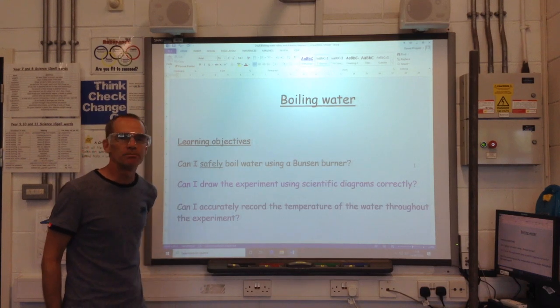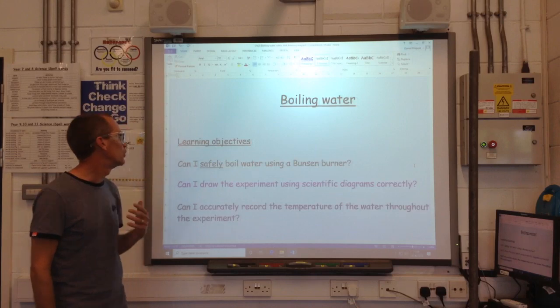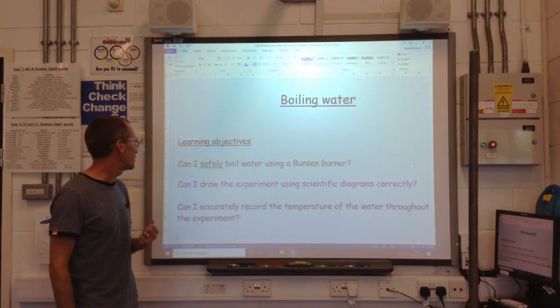Hi everyone, welcome back. This is the Redbridge Science Channel. Today I'm going to show you how to boil water safely.